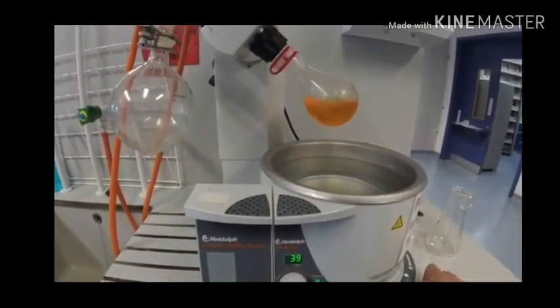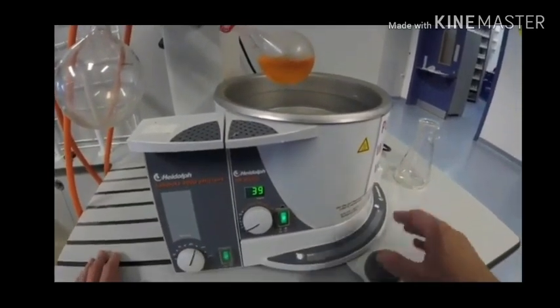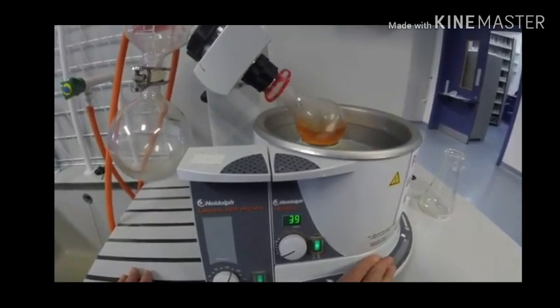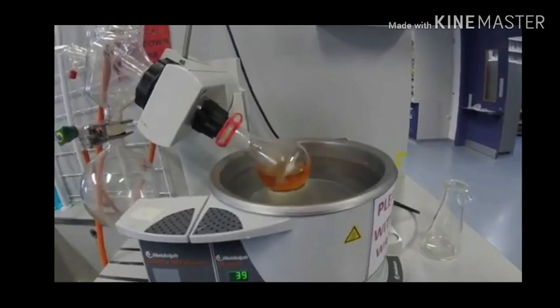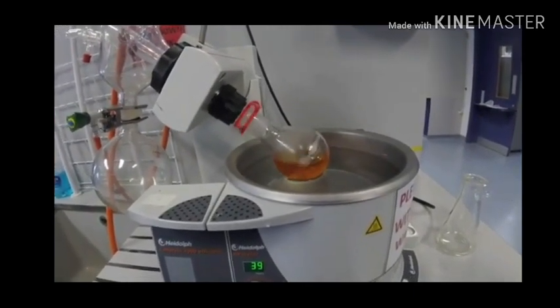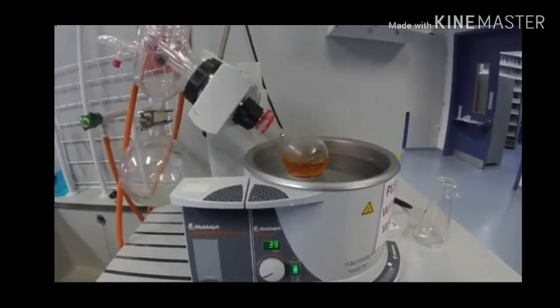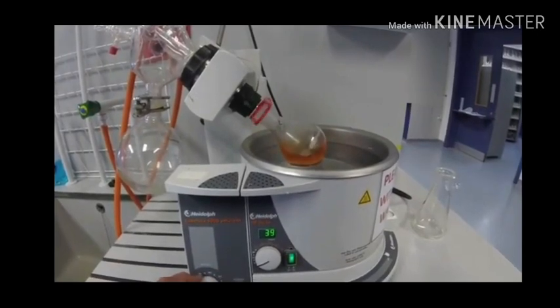Once that's going like that, we then slowly use this to lower the flask just so the bottom portion now is in the water bath. You don't need the whole flask in the water bath, just that bit. And we can see it starting to evaporate. We can turn up the speed.